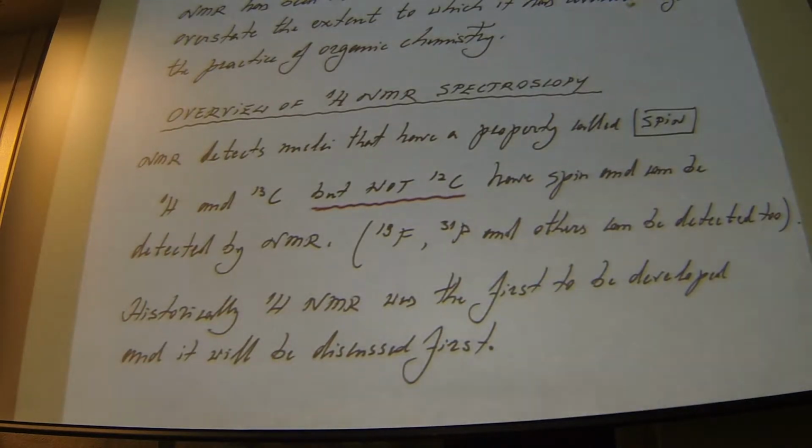When I started studying chemistry, it was common to run samples on 50 to 100 milligrams. And anything less than that, you wouldn't get good spectra. Now, routinely, and this happened when I was in graduate school, you can get very good spectra on milligram or sub-milligram quantities of material. And that's really revolutionized the way research gets done and the way drugs are discovered and many other things.